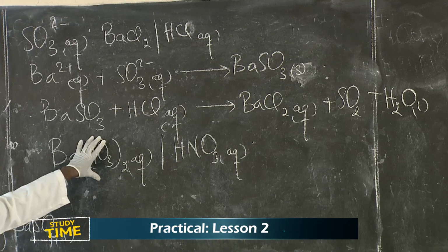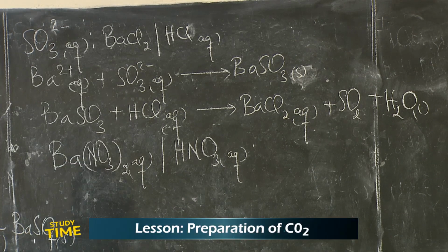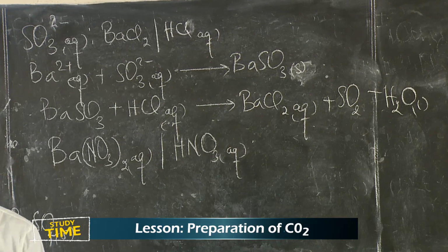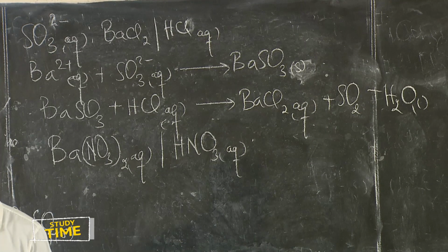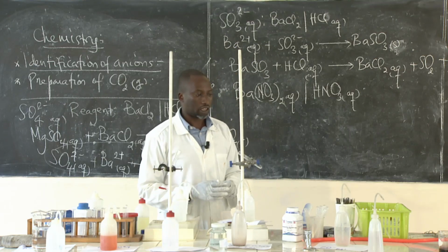So that is why I'm saying these ones can also be used to test for the sulfate and the sulfite ions.